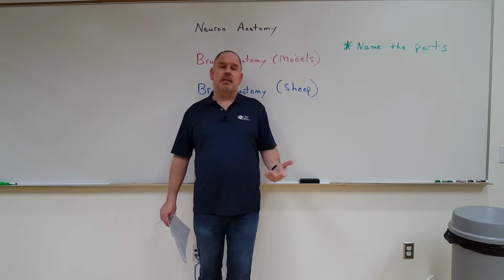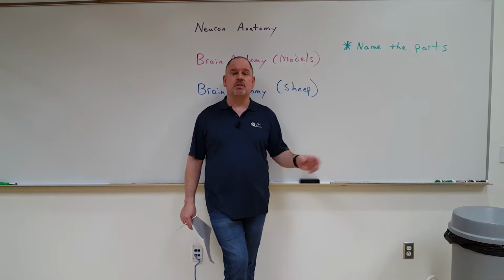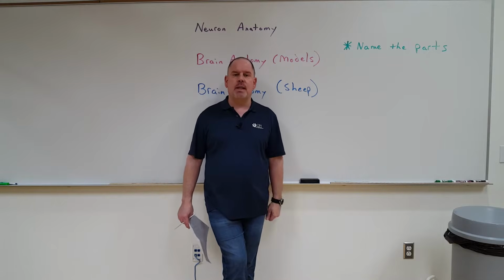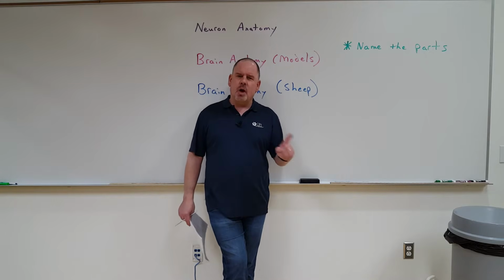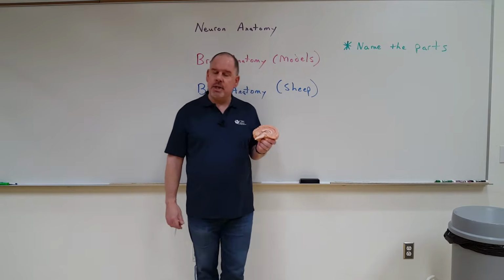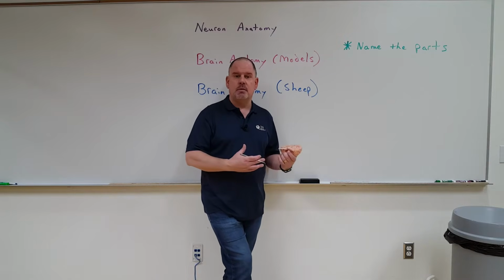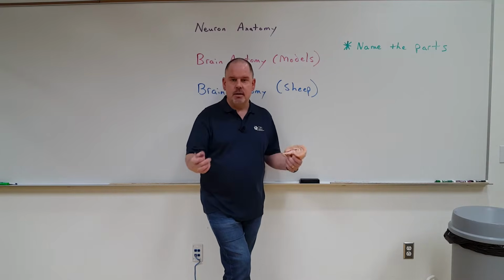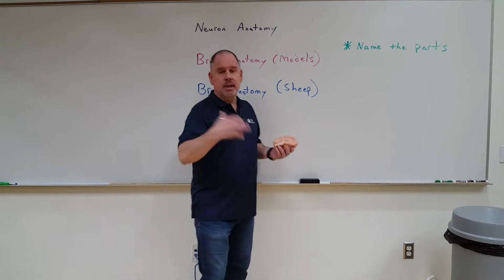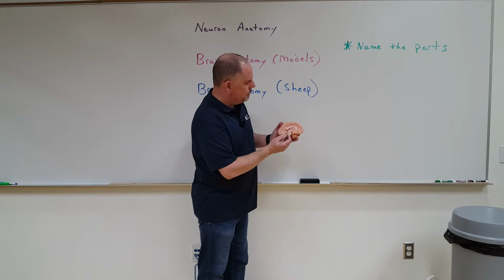Now, as I mentioned in the intro, we always want to look at the models first, then the actual dissection. Hopefully it won't be that bad for us, but there is one problem to overcome. That problem goes something like this. And do not attempt to zoom in with your streaming. You'll get to see this close up. But a typical problem challenge in lab number 7, watch the tip of my probe here.